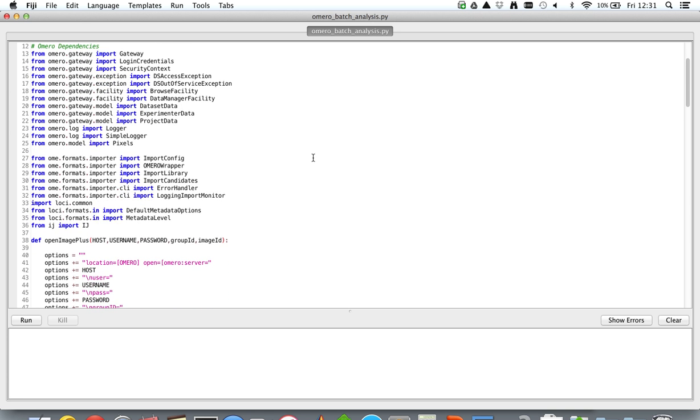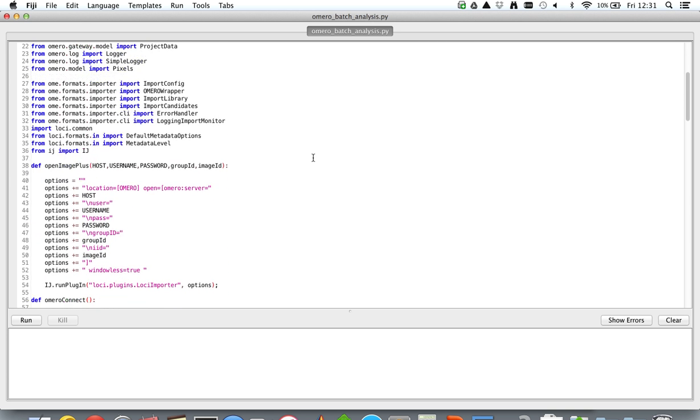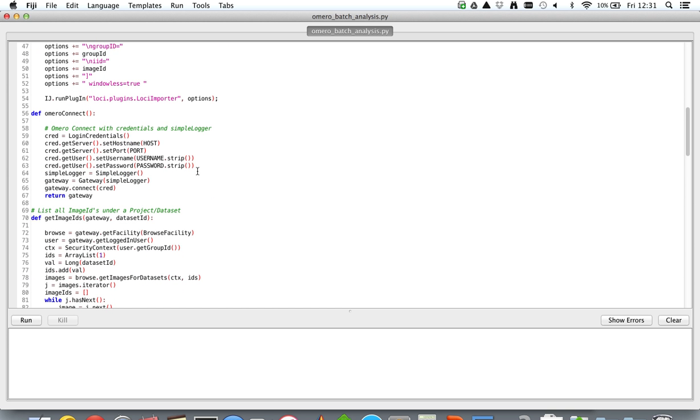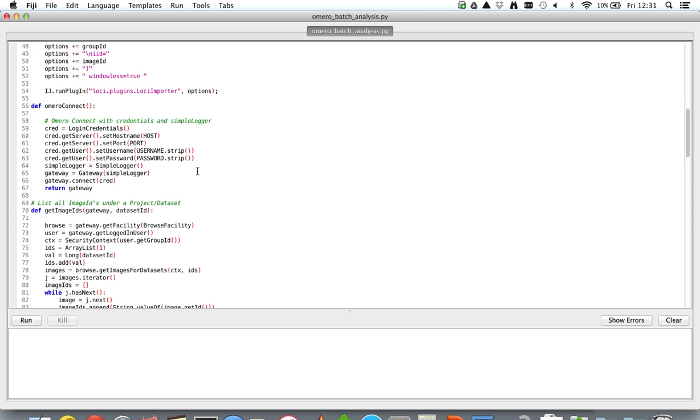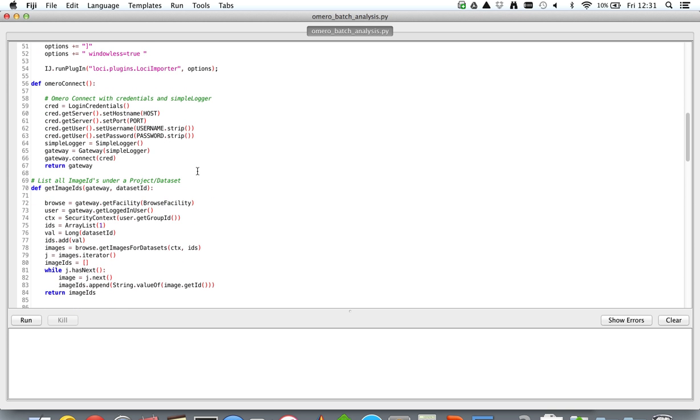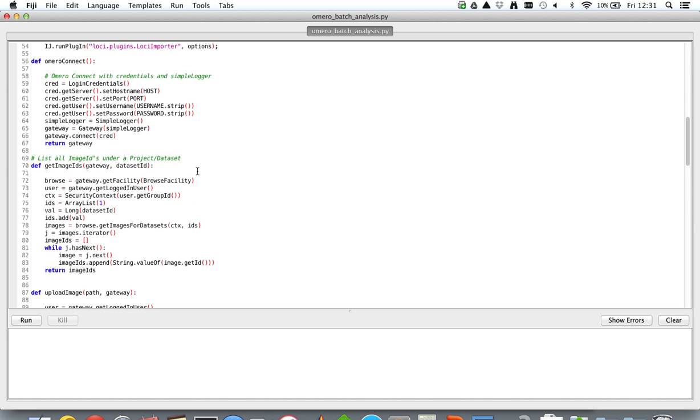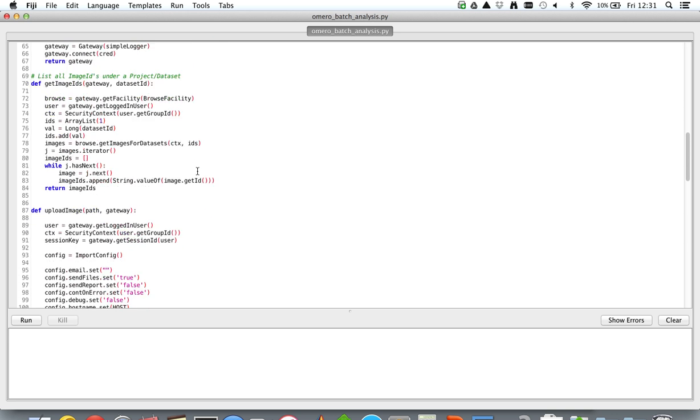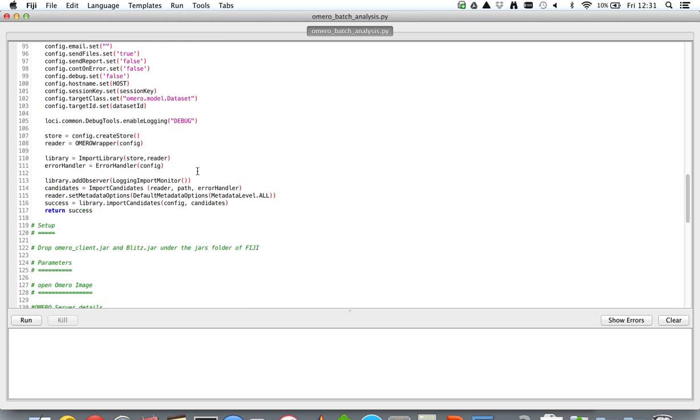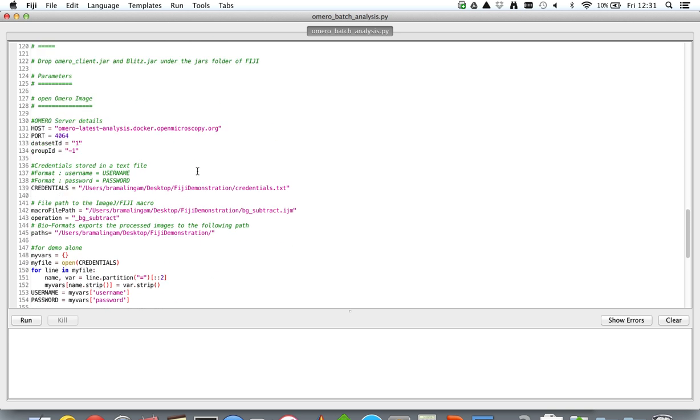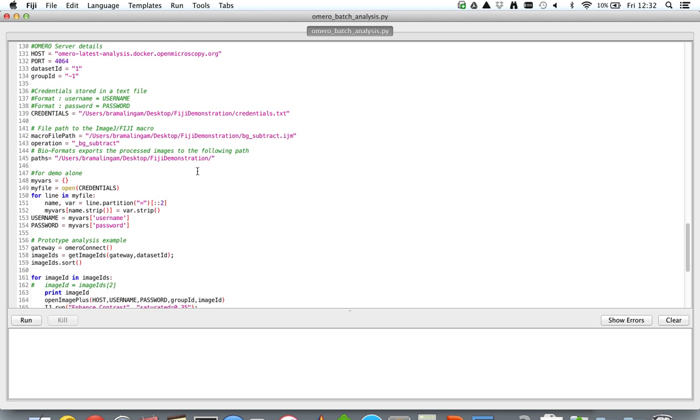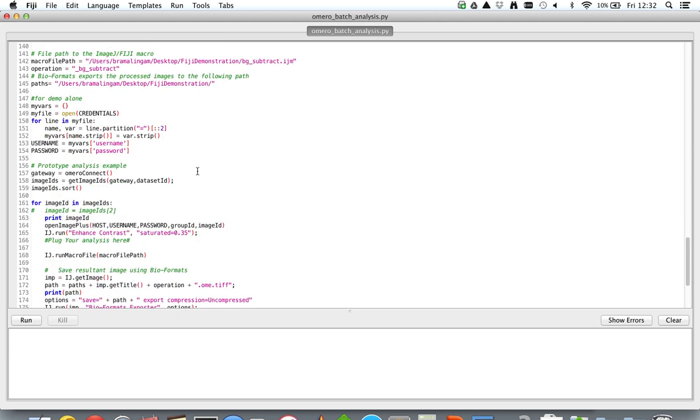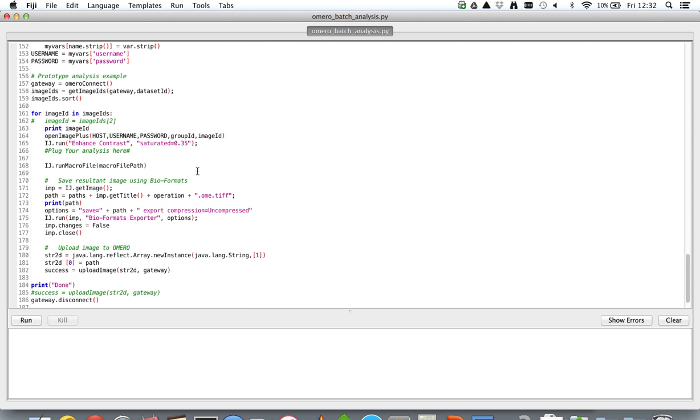What this example script has is a few accessory methods to interact with the OMERO server from the Fiji scripting interface. And this script being a prototype does the following.